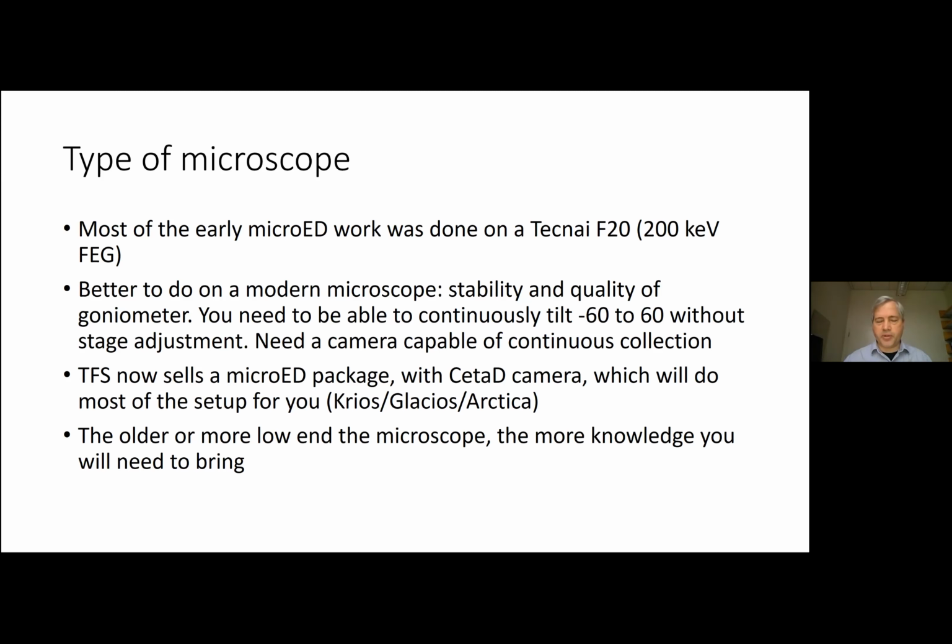And then it becomes more like a plug and go package. You still have to make the crystals, of course, and screen for them, but you don't have to worry about setting everything up and getting everything working. So that would be one way to go, especially if you're not an expert in diffraction or even in regular TEM, and you just want to get up and going. I don't know if JEOL has done that or not, but I imagine if the market becomes big enough, they would do the same thing.